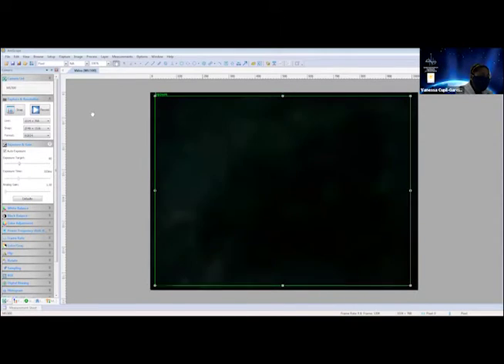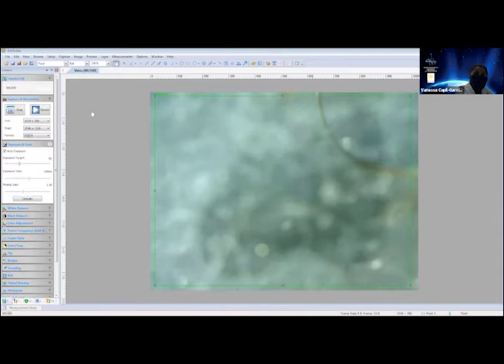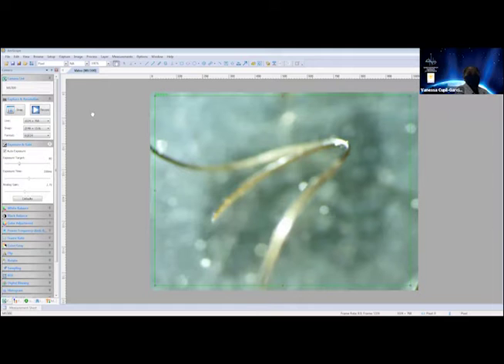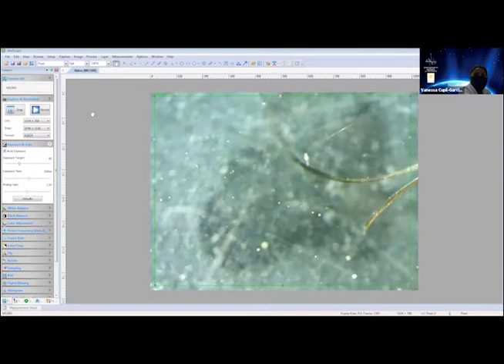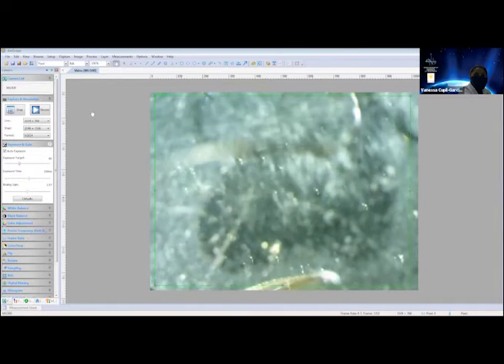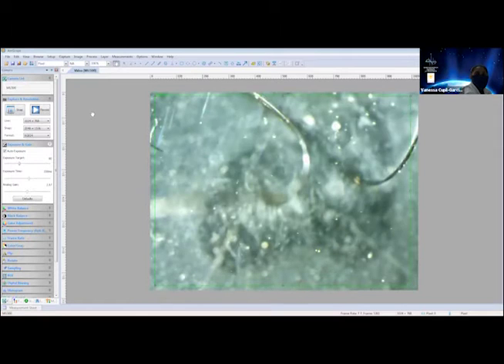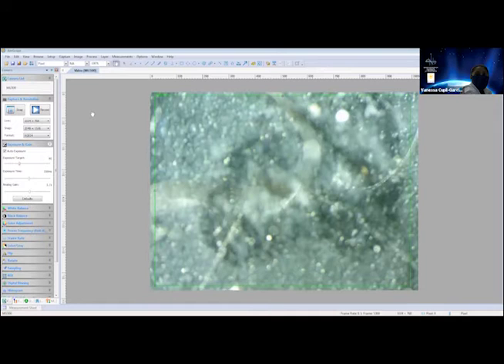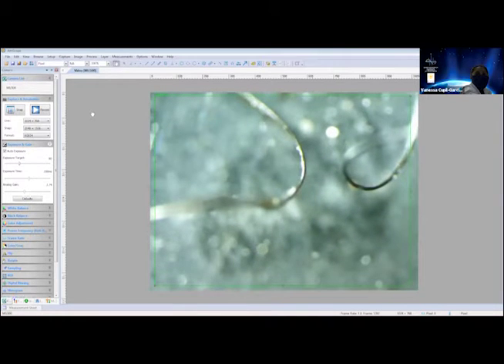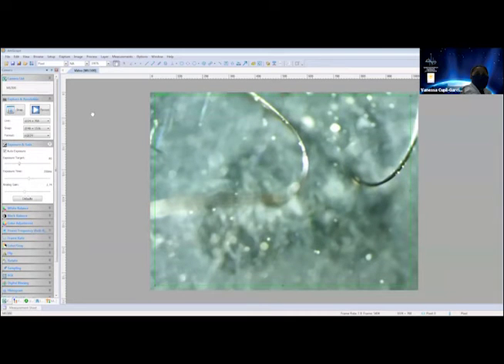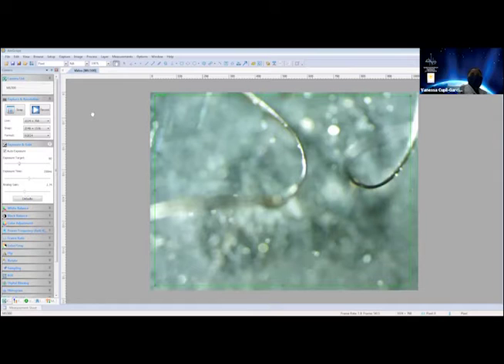And the last sample we're looking at is a piece of hair. We can see that this piece of hair is curly. You can see that it's curly. We see that it's a brown color. But with this light microscope, we really can't see any more than just the general structure of our samples. So we're going to switch over to the scanning electron microscope and see what we see with that more powerful microscope.